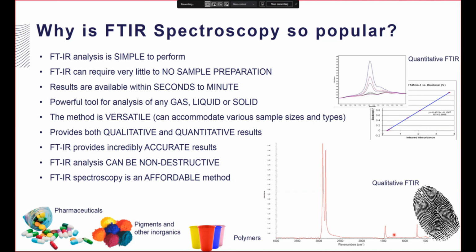Also, it's quite accurate, and it can also be non-destructive, so it can be interesting, for example, in forensic science, where we have to be careful not to destroy the samples because there are evidences. And also it's somehow an affordable method compared to other analytical techniques.